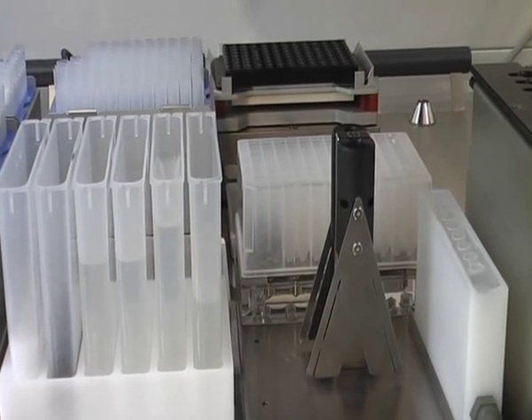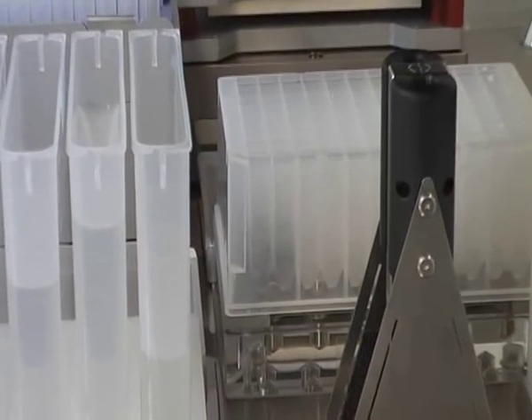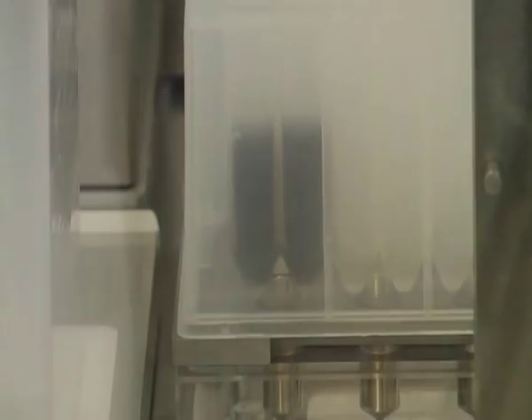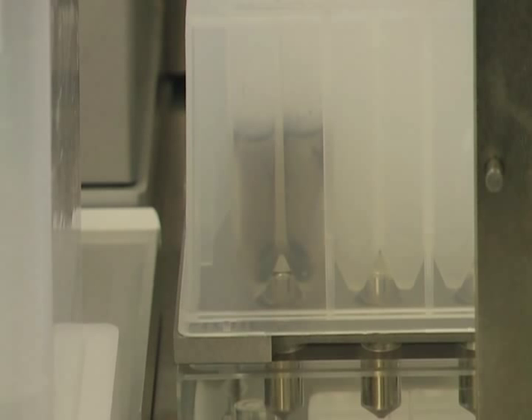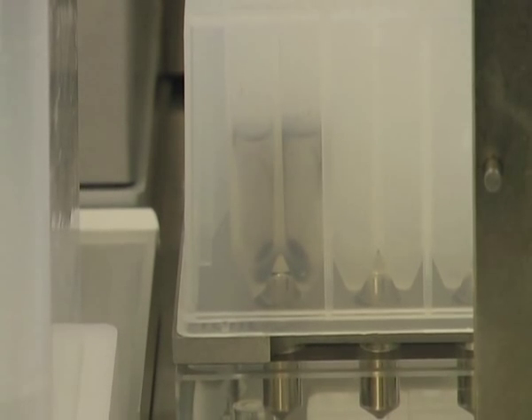We shot this 3 minute separation step in fast motion to show how the magnets cause the beads to form a pellet at the bottom of the wells. This bead pellet now contains the extracted DNA, whereas protein, cell fragments, and other impurities remain in the liquid phase.